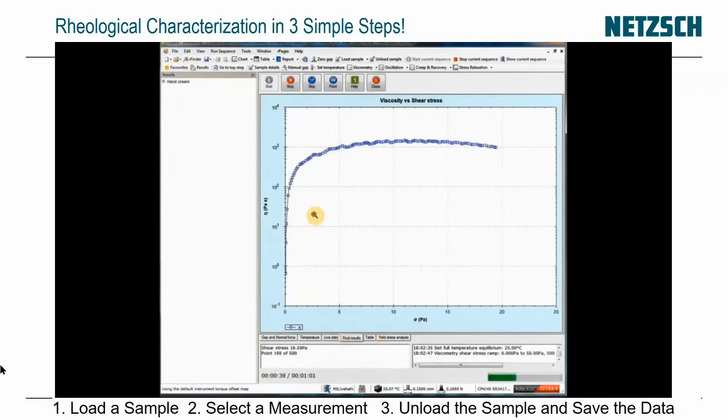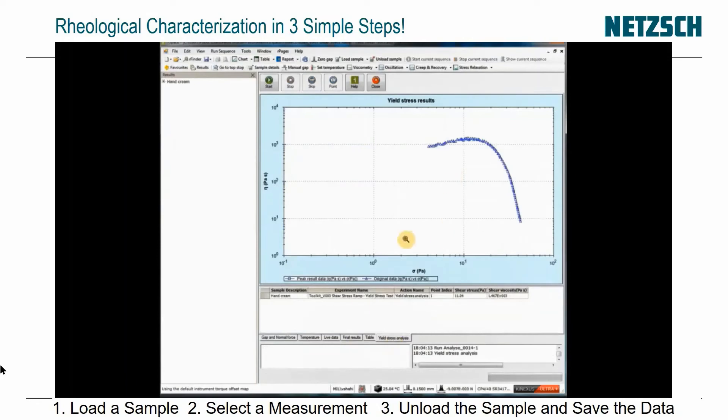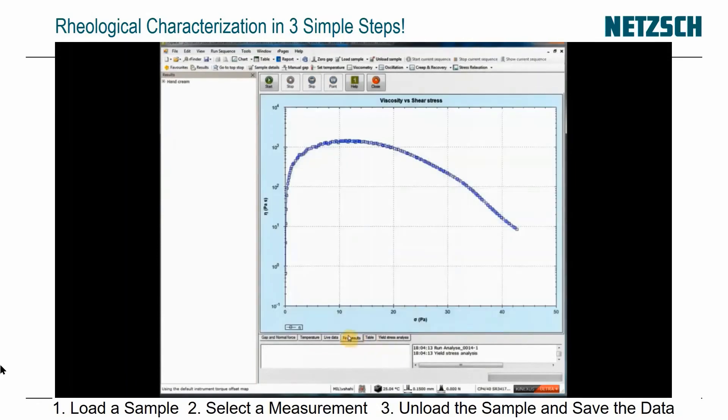The material is being stressed, and when it gives a peak, that shows it's just starting to flow. Initially it wasn't flowing, then it peaked, and then it goes into viscous flow behavior. That peak is around 12 pascals, which shows the yield stress of the sample. It's done an automatic analysis.